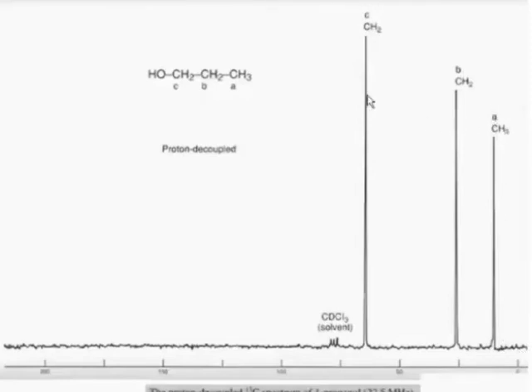All right, now there's something else. With proton NMR, we learned that the number of protons in an equivalent set is related to the size of the peak that set produces. The more protons there are in the set, the larger the peak.